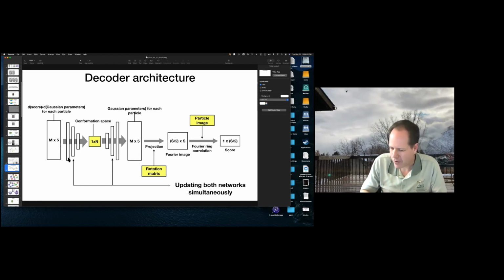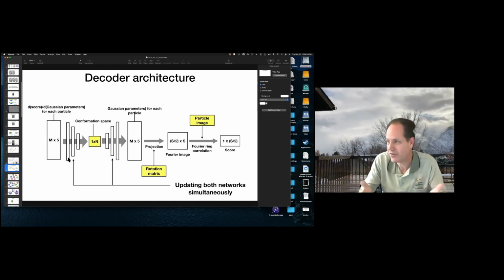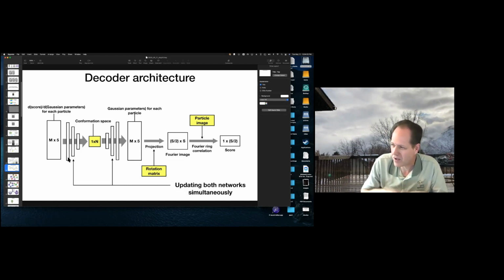But beyond that, there are the fundamental questions of whether there's enough signal present in the data to do it on a per particle basis or not. But you're thinking in exactly the direction that we're going with some of the new refinement strategies. You don't need to take it to that level to be able to use it as a tool for getting more accurate particle orientations and refining other parameters. So you could do that with even, say, 1,000 Gaussians. I mean, you can do it with 6, but you can do it pretty well with even 1,000 Gaussians. Then you can simultaneously characterize the orientations and the variability of the particles in a model like this.